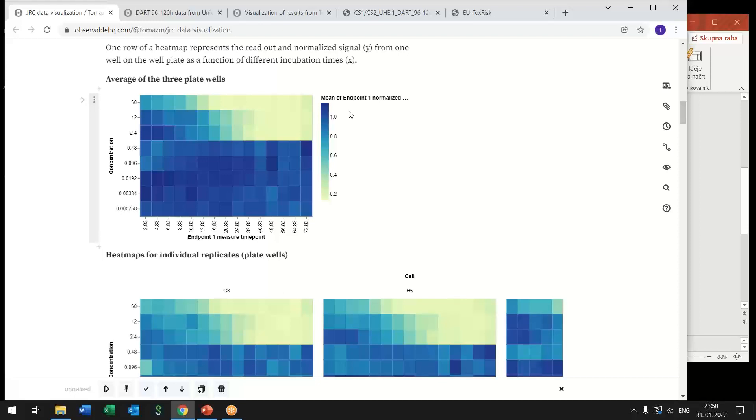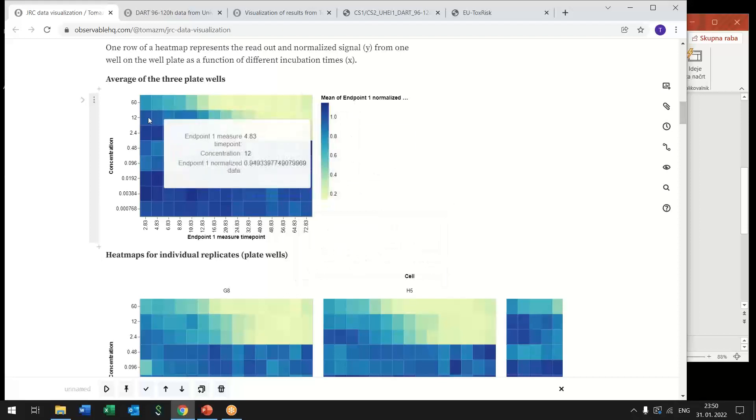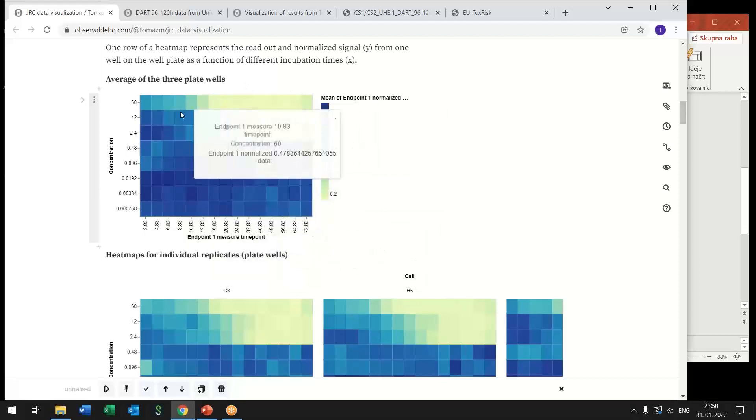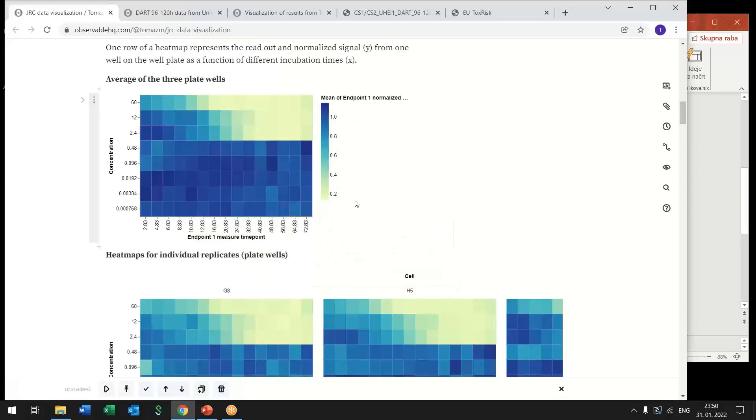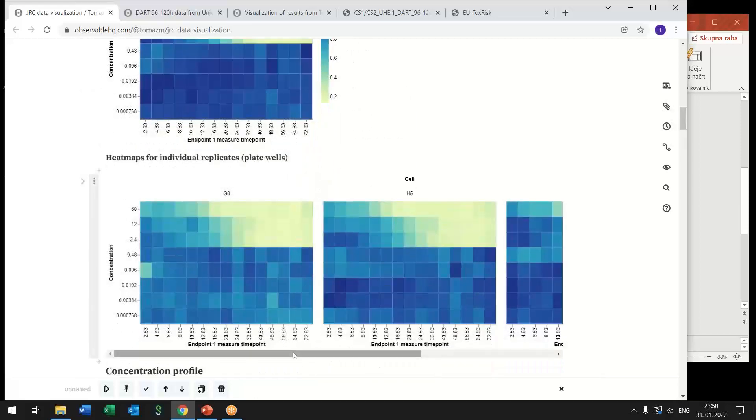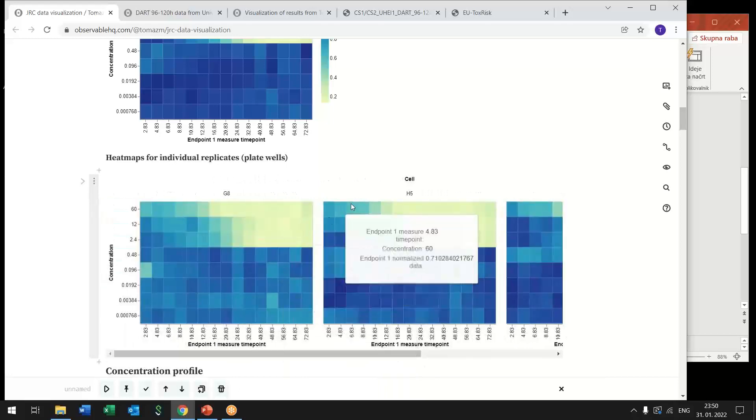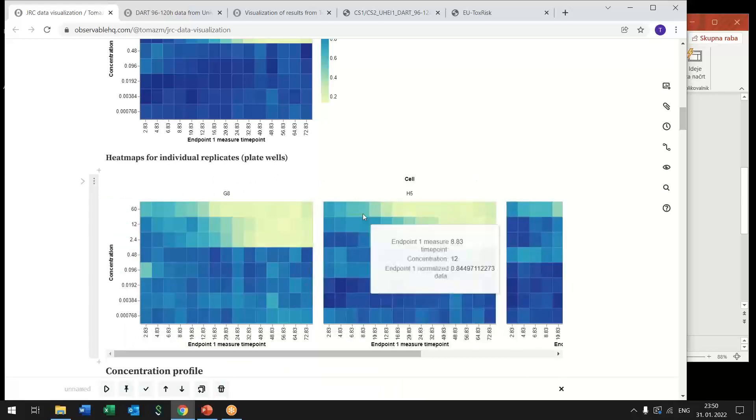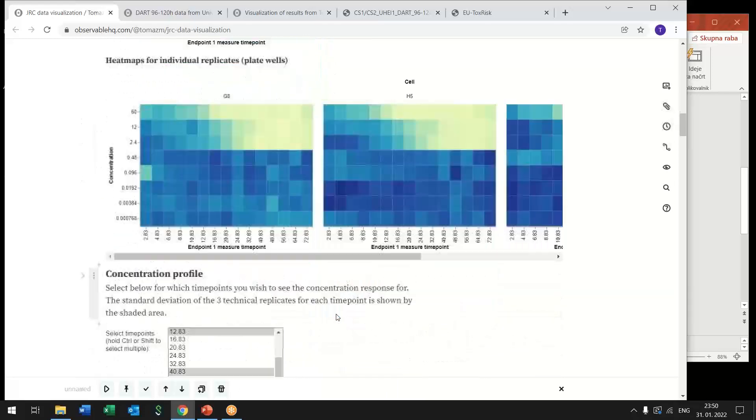And that's why we can represent this data as a heat map where each row represents a single concentration and from left to right time point increases. So the first heat map is actually the average of the three replicates that were done in that experiment and below we have three heat maps each is a single replicate.